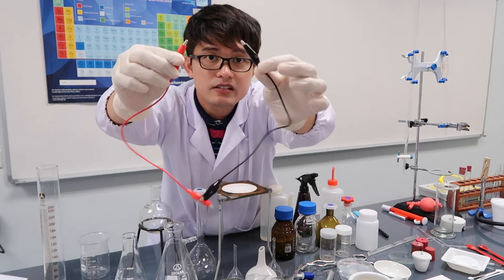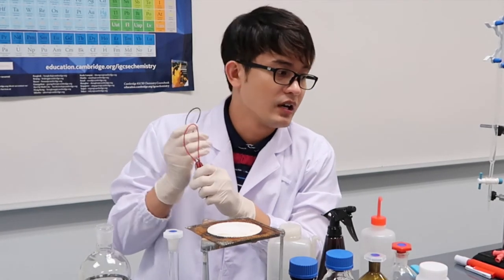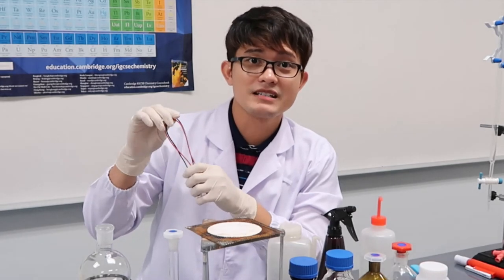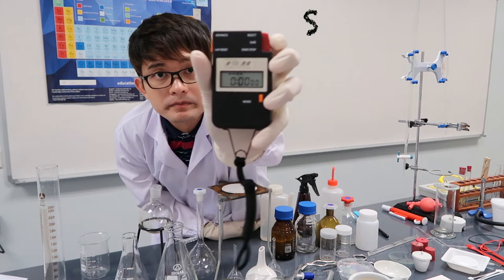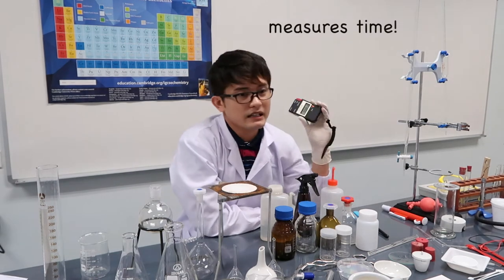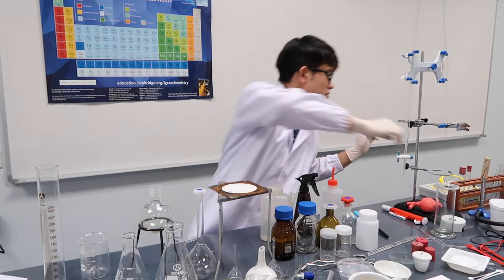These are crocodile clips. Usually used in physics, but in chemistry we have electrochemical experiments — like voltaic cell experiments — where certain chemicals produce electricity, and we need these. Something important also is a stopwatch: we use it to measure time since cellphones are not allowed during tests.